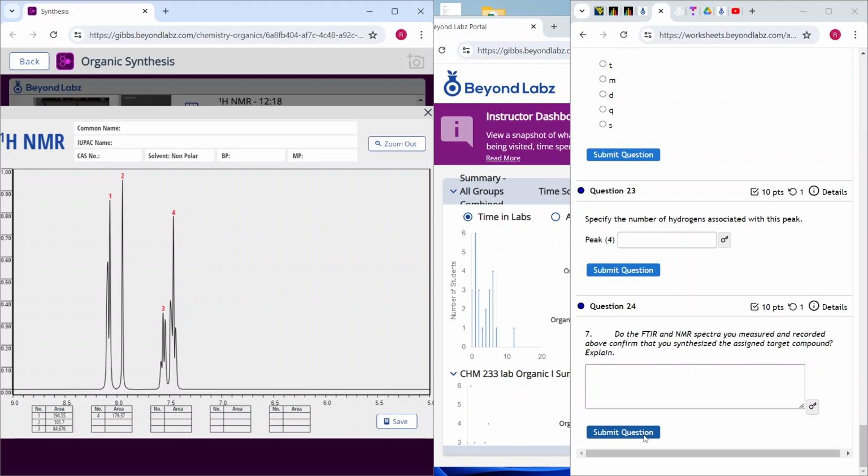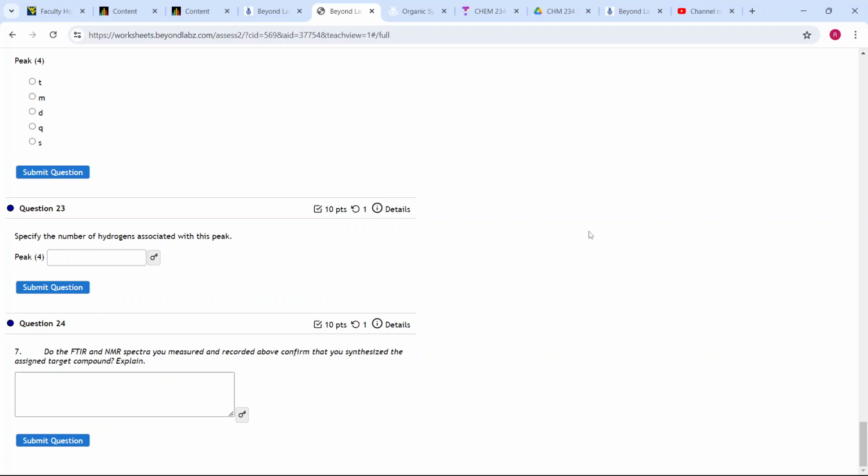If you still have further questions whenever you are working on your lab, please let me know. But for every single lab that we work out, we explain the reaction. So you would need to look at the reaction, understand the reaction and the mechanism before you proceed and make a synthesis method in order to synthesize that product.